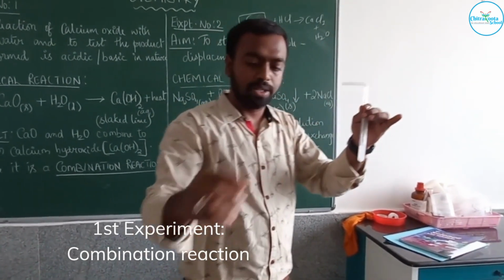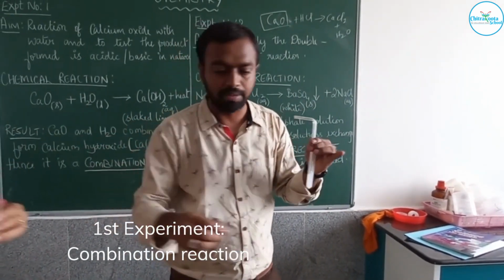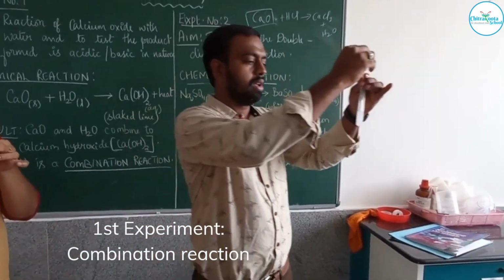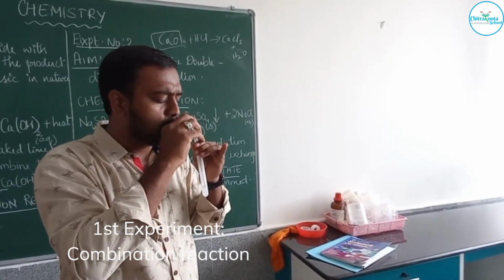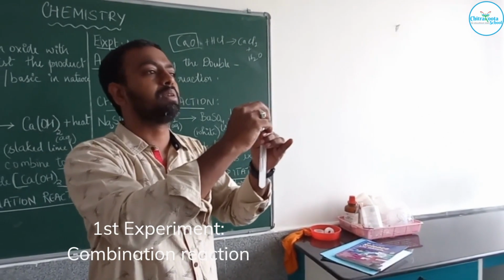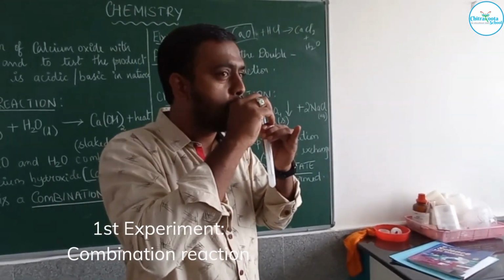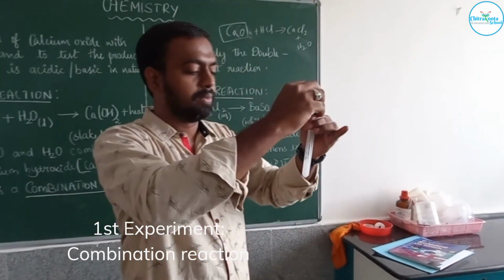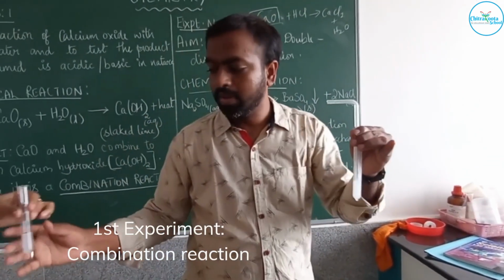For color comparison, we will put it into some other test tube and remove it. Are any changes happening in that? Yes. Try to observe the color, whether it is becoming milky or not. Just try to observe the color. See the difference?